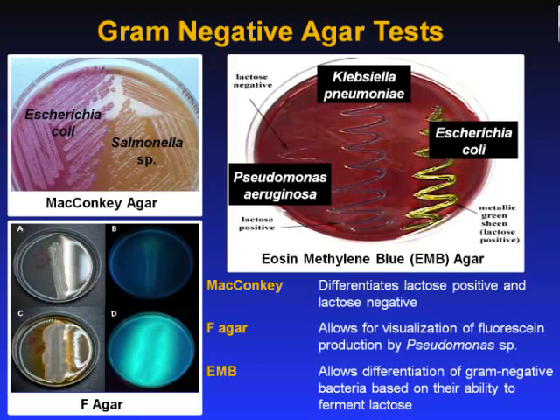By utilizing the lactose available in the medium, lac-positive bacteria such as Escherichia coli, Enterobacter, and Klebsiella will produce acid, which lowers the pH of the agar below 6.8 and results in the appearance of pink-red colonies. Non-lactose fermenting bacteria such as Salmonella, Proteus species, and Shigella cannot utilize lactose and will use peptone instead. This forms ammonia, which raises the pH of the agar and leads to the formation of white or colorless colonies, or colonies the same color as the medium. Some organisms ferment lactose slowly or weakly and are sometimes put in their own category. These include Serratia and Citrobacter.